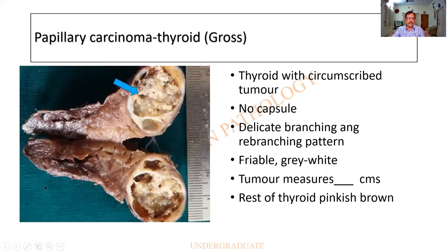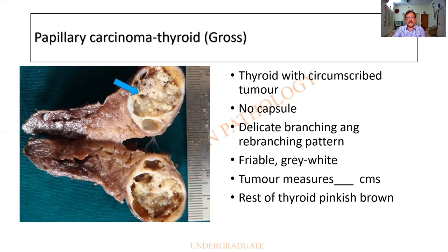This is a beautiful specimen of a thyroid. They have probably done a hemithyroidectomy and found a tumor, or this would have been diagnosed by means of an FNAC — fine needle aspiration cytology. The thyroid shows a circumscribed tumor. Circumscribed is not capsulated; it is somewhat demarcated but not capsulated. It is identifiable because of a delicate branching and rebranching pattern, grayish white in color. The rest of the thyroid is somewhat pinkish brown.